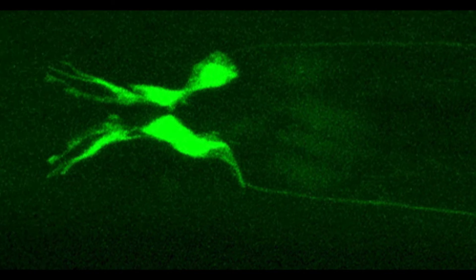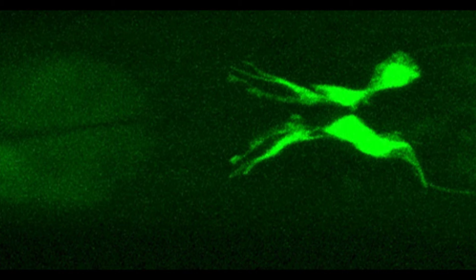Notice the two faint GFP expressing canals on the right, as well as the fine ducts on the left. These structures were not visible using a standard epifluorescent microscope.